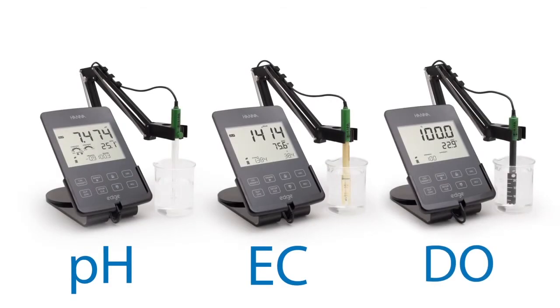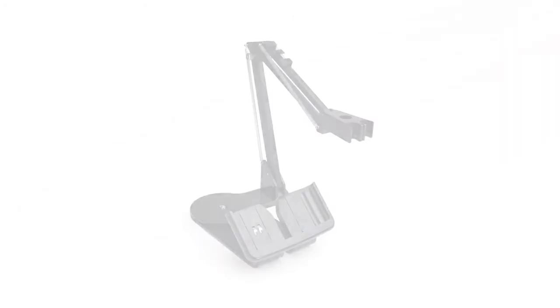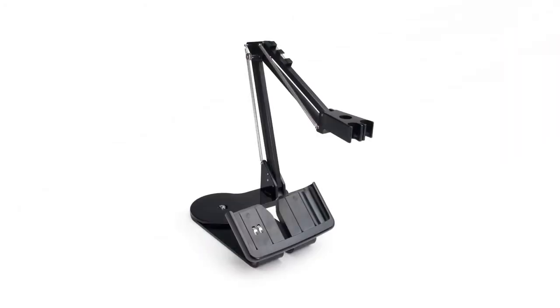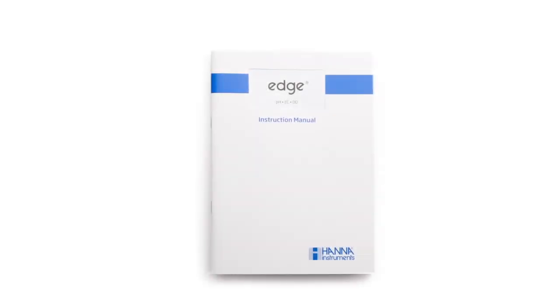EDGE is available in three configurations: pH, EC, and DO. Along with EDGE, each kit comes with its respective electrode, a benchtop docking station with electrode holder, a wall mount cradle, a USB cable, a power adapter, and an instruction manual.